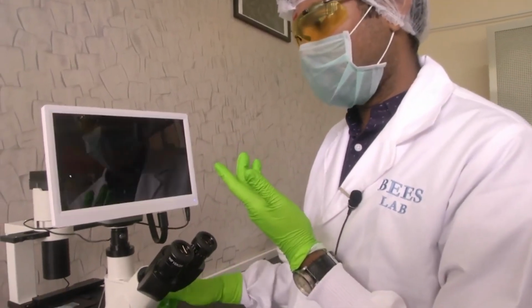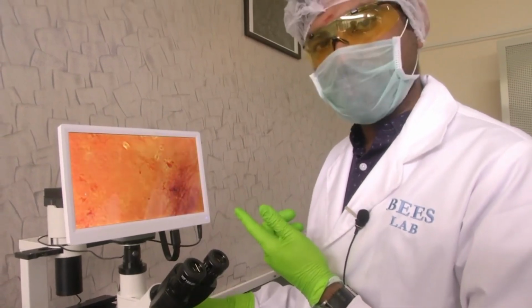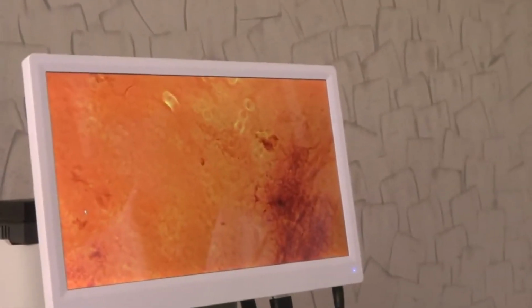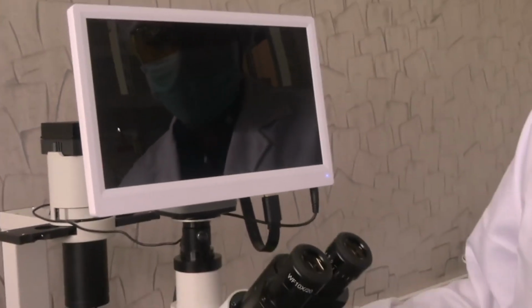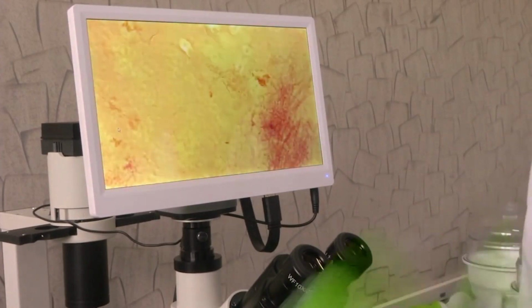Like you can switch off the imaging to your camera. So, if there is a knob, if you turn it, you can switch off the imaging to the camera, then you can just look at it through the eyepiece. Then you can even shut out the eyepiece with another switch. So, these are minor ergonomic options that are provided with different designs.